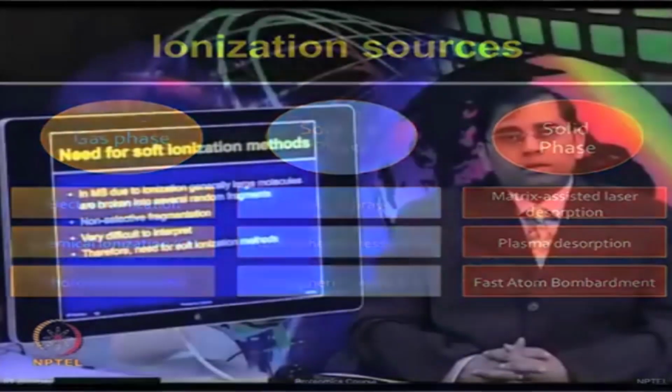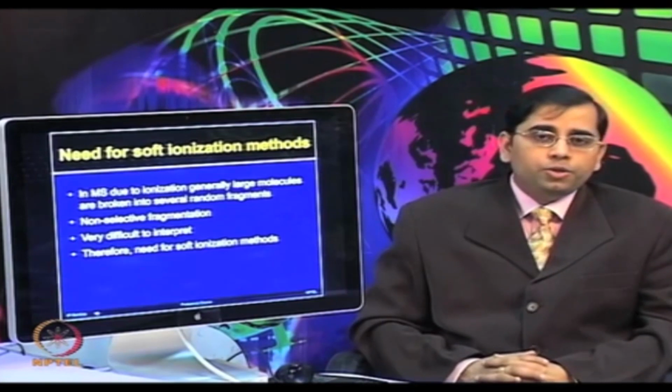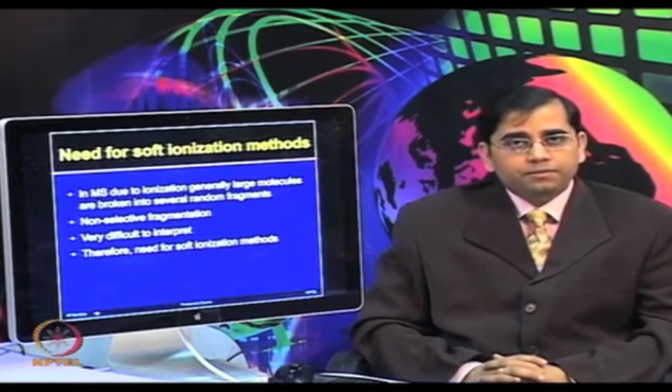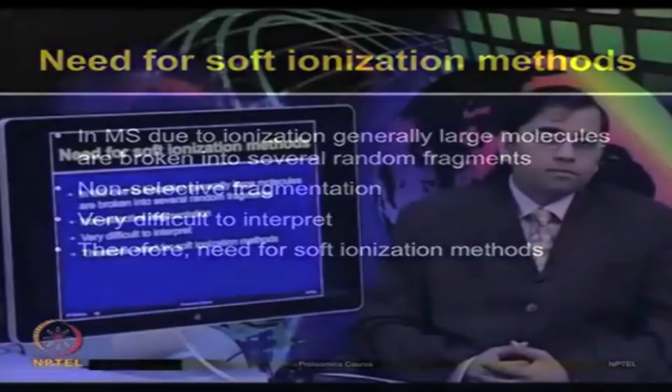The traditional ionization sources used for small molecule chemical applications relied on chemical or electron ionization, but these processes are too energy-rich to ionize intact large biomolecules and they lead to unpredictable analyte decomposition.